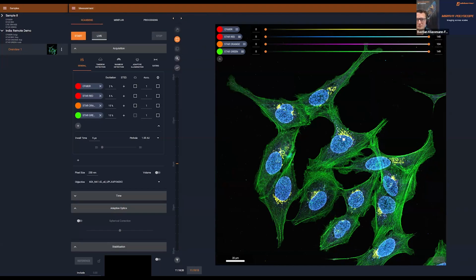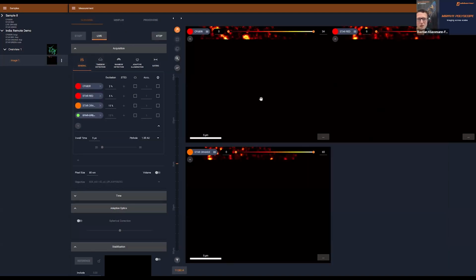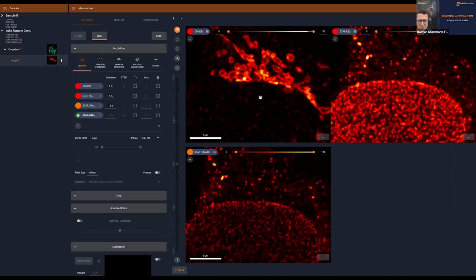And now I could basically just go here, define a smaller ROI, and I can also define 20 of those, mark all of them, and press play as soon as all the settings are adjusted. However, now I'm deactivating this to speed the process up a little bit. Can go into my overview here. Again, focus a little bit maybe. So something like this.